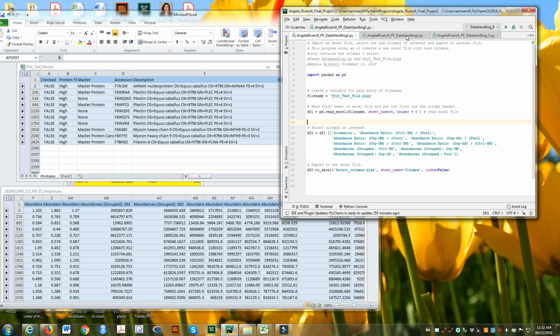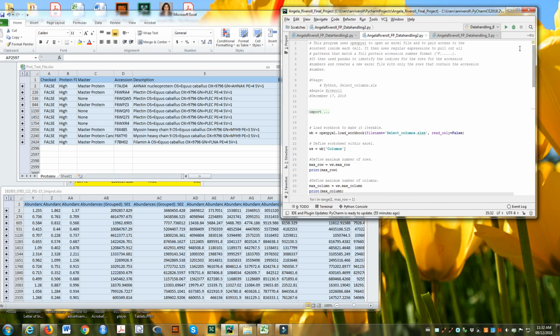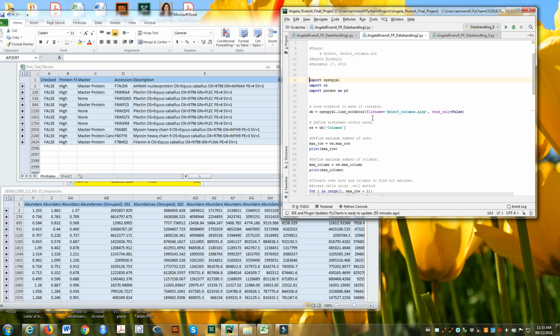And then step two, I wanted to then be able to iterate over this data that we got from Excel. And this was a little more difficult than I thought it would be, but luckily there's lots of communities online to help, and I realized that I could use this openpyxl to be able to iterate over my Excel sheet.